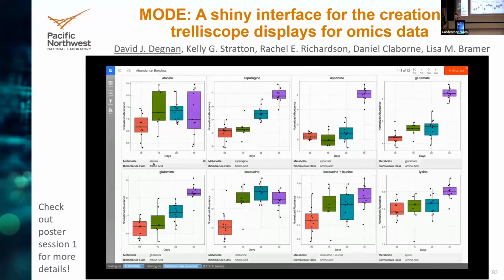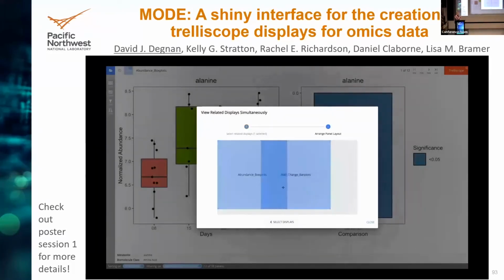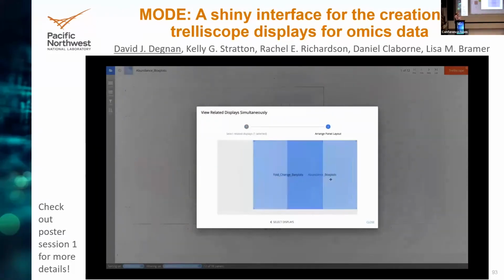And so this would be really difficult to look for in just an Excel sheet or by making lots of plots and hoping you find something. Here, we're removing that extra time needed to identify these trends. You can also add other plots.